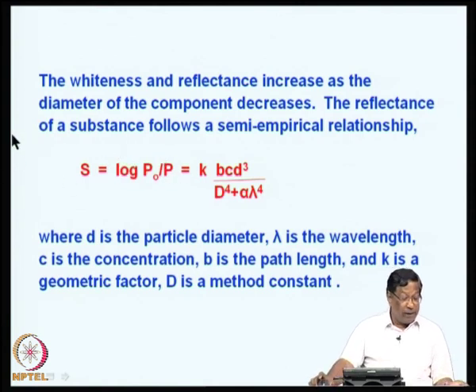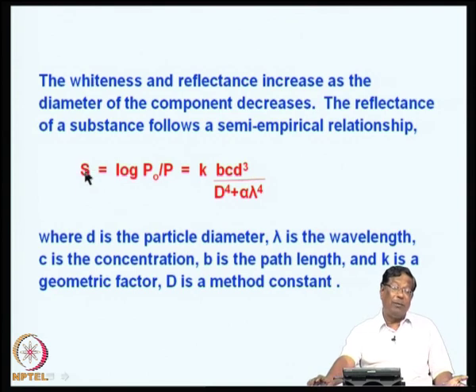So, for reflectance, what you would need is a good standard. The standard is a magnesium oxide standard as a reference, and all other measurements also must be made with this reference. Sometimes even titanium dioxide is a very good standard, and it is available as a standard accessory from the reflectance instrument manufacturers. These measurements are routinely performed in paints, textiles and paper industries etc.